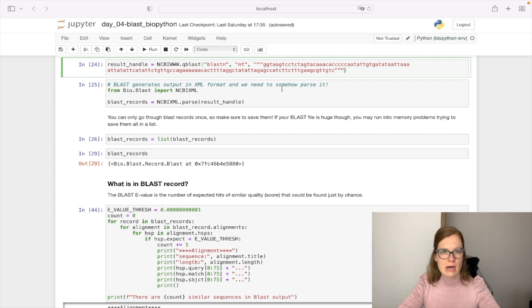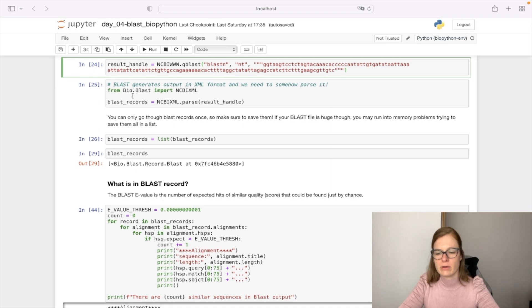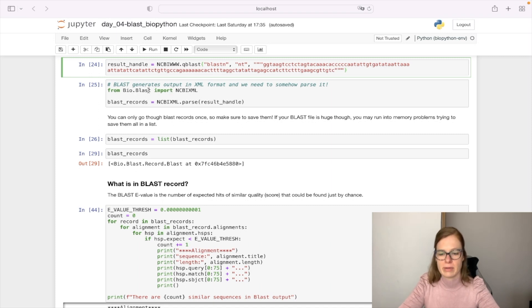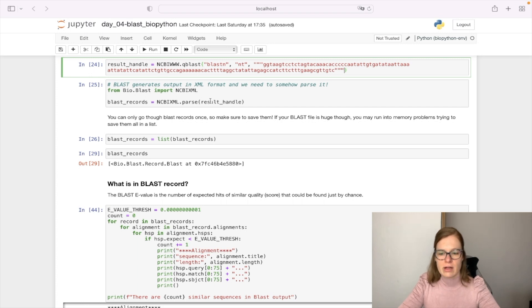BLAST generates its output in XML format, so we need to parse it. For this purpose, we will import NCBI XML from bio.blast and use the parse function to return the result of this BLAST search.